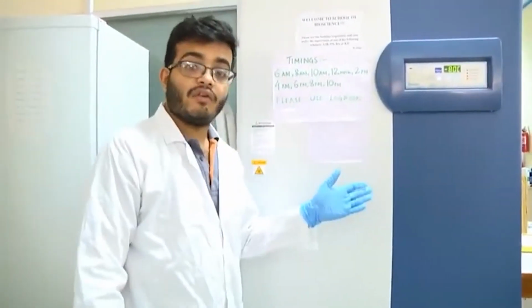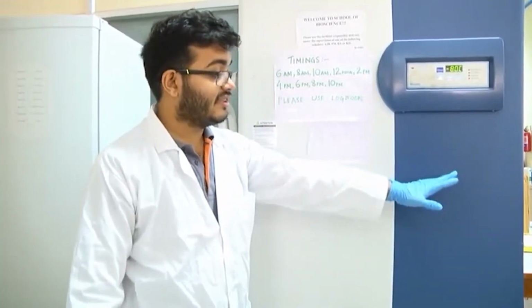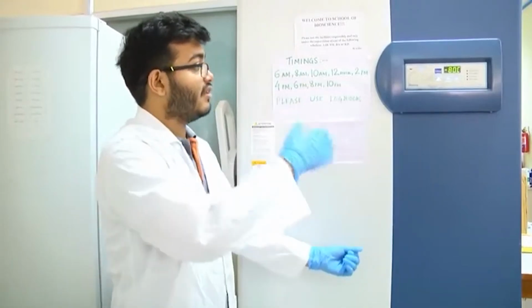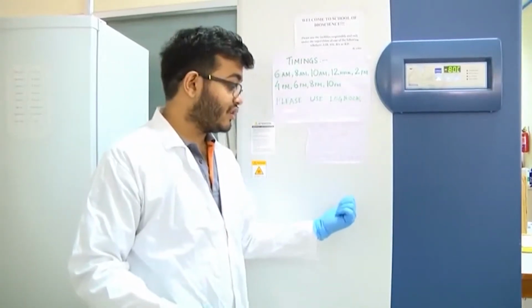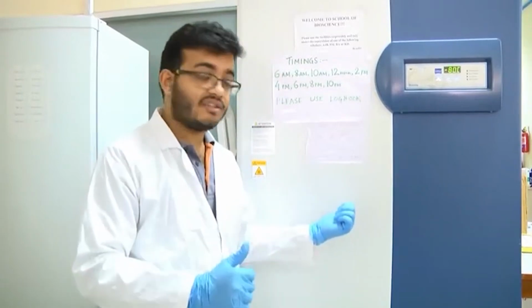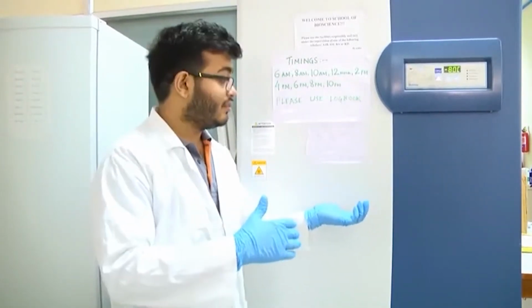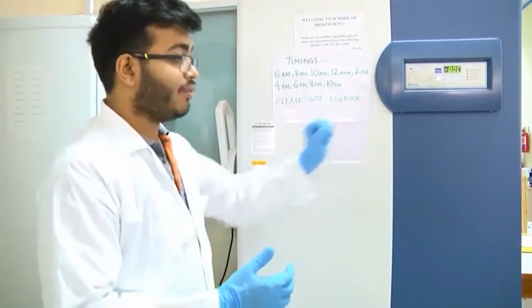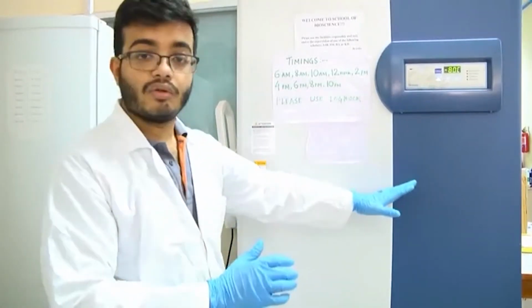Keep in mind that under normal conditions you should not keep the minus 80 degree centigrade freezer open for so long. I just kept it open so that you could get a view, but normally this is a very important instrument which contains a lot of very priceless reagents which are not to be handled frivolously. So, normally when you are working in the lab, you immediately open the minus 80 degree centigrade freezer, take out what you want and proceed. You do not keep the door open.